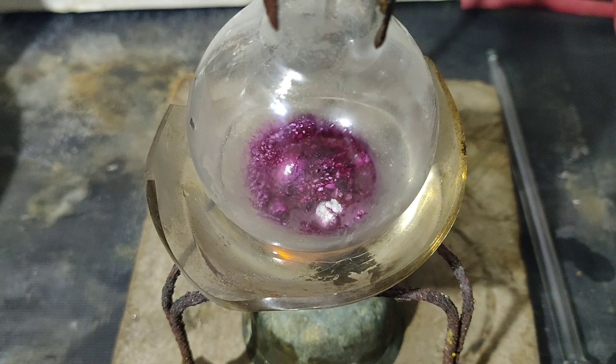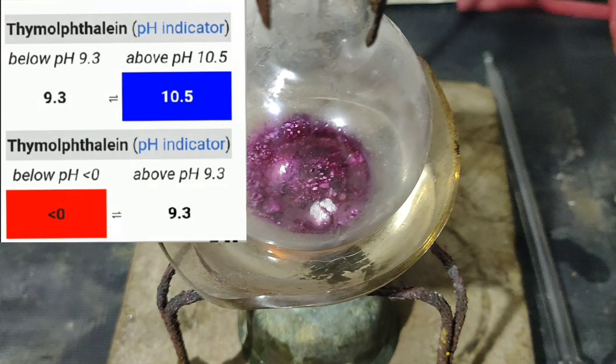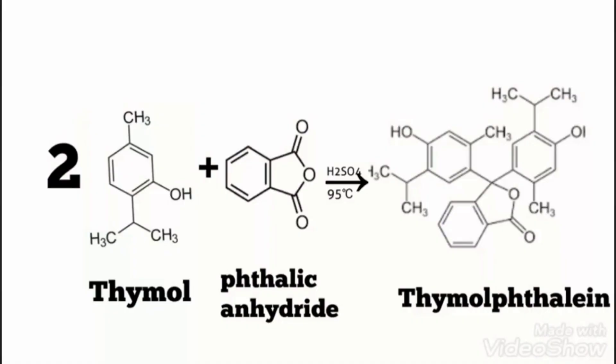Then the flask was kept in a boiling water bath for an hour, where it turns into a magenta colour. This is the colour of thymol phthalein — it is magenta at pH less than 0 and blue at pH more than 10.5. What's happening here is 2 moles of thymol reacting with 1 mole of phthalic anhydride in the presence of sulfuric acid to form thymol phthalein.